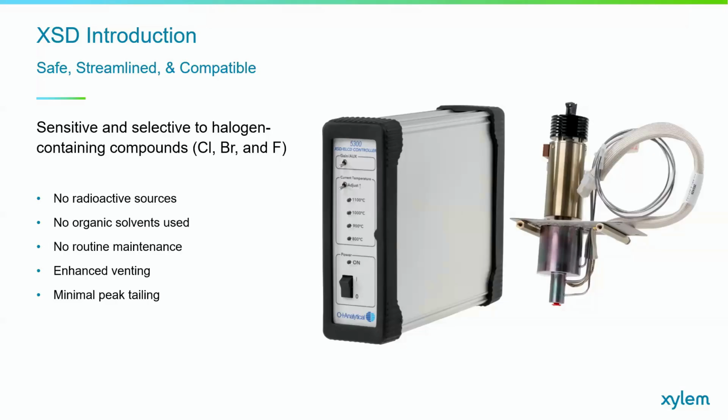This diverts solvent away before entry into the reactor core. So this is another industry standard for testing oil, for testing pesticides, organochlorine pesticides, and we will go into the operation, assembly, applications, and some example chromatograms of this detector.